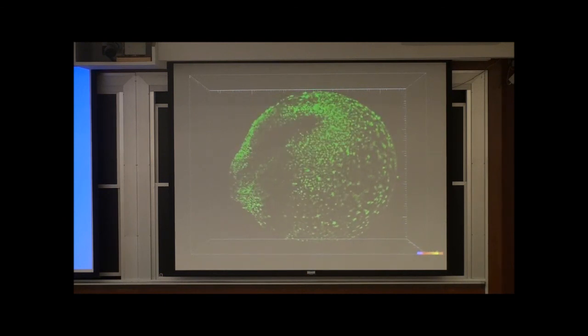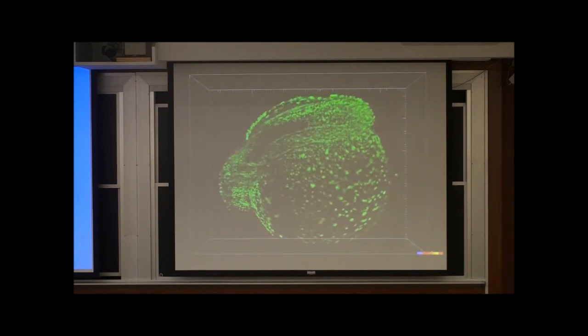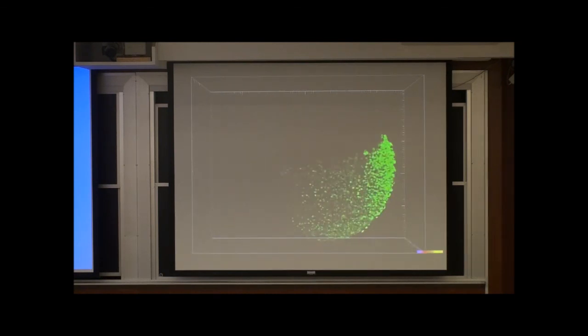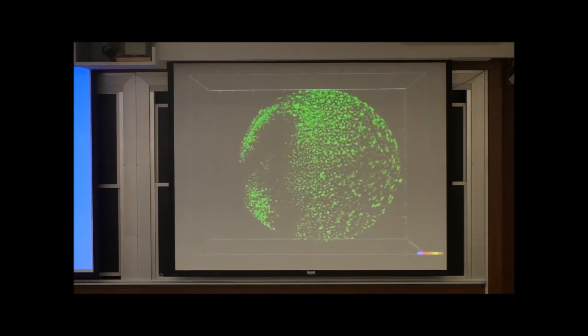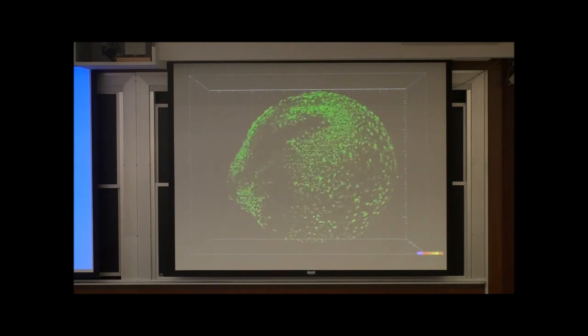Sure. So what is the confocal parameter of your illumination? How much does it diverge along the axial direction? So in the middle part, it is around 3 micron thickness.